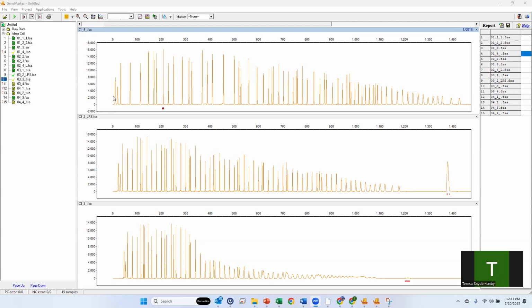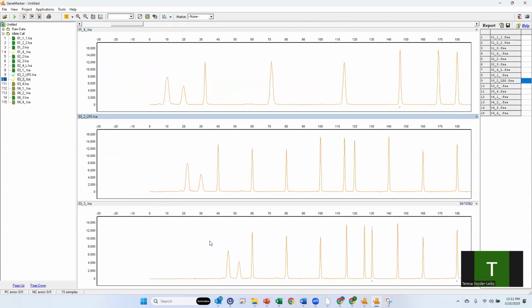to look at examples of how to rescue these samples. When we take a look at it, the first one we see it's really stretched out. And the second one, there are some issues with it. This here at the end, loss of resolution, there will be no rescue for these, but it will be possible. So we kind of zoom in here in the lower size range. You can see that this 40 peak is actually seen as a 60 in 3-3. So we will be able to rescue these peaks here at the lower range that are high quality.